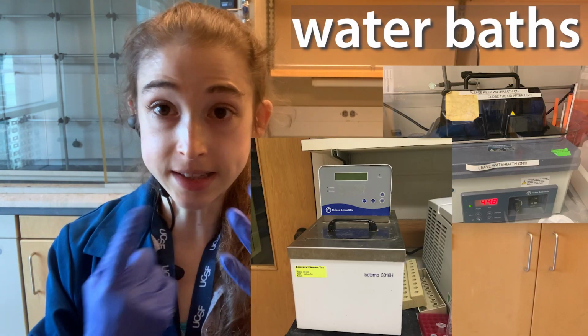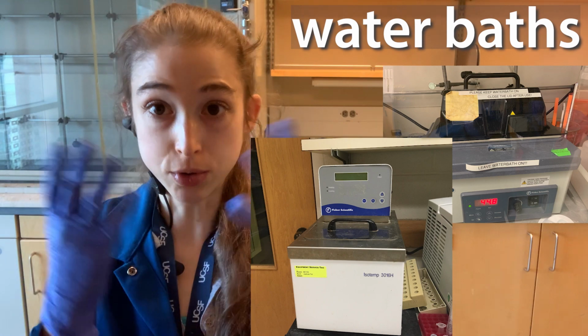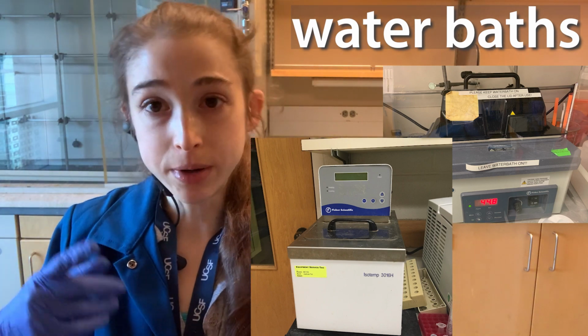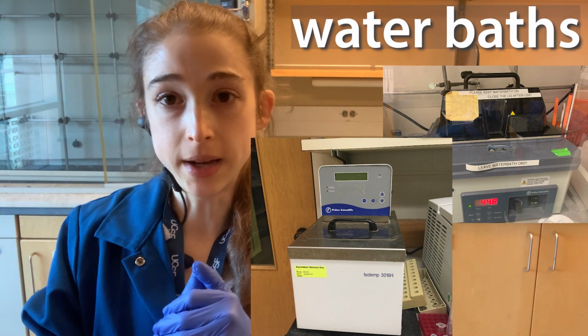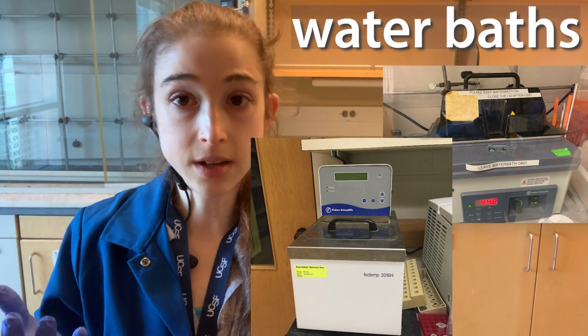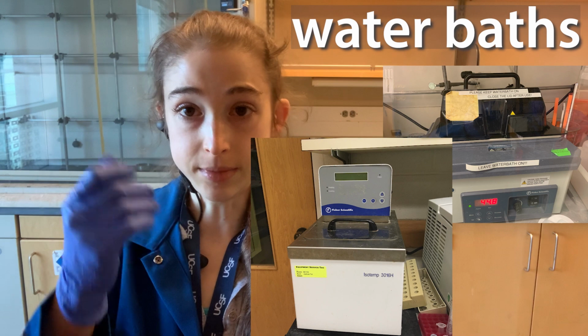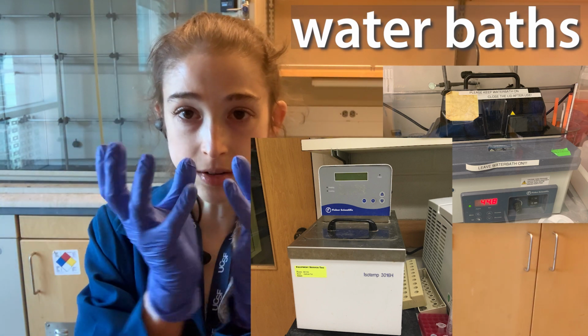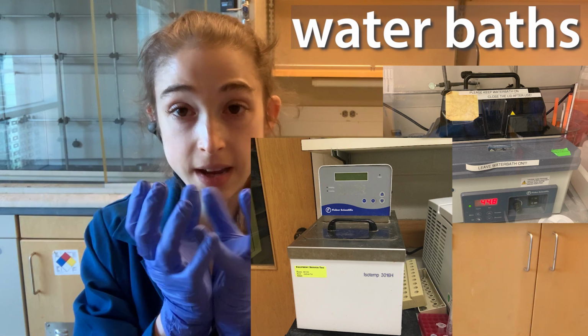Another way to get a consistent heating of something is to surround it in liquid. So, to surround it in water. And now we move on to water baths. A water bath is just what it sounds like. It's a bath, but instead of getting hot because you're putting hot water in it, it gets hot because you are warming up the outside of the container.